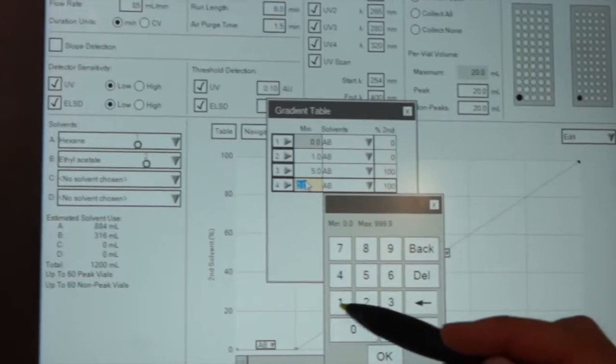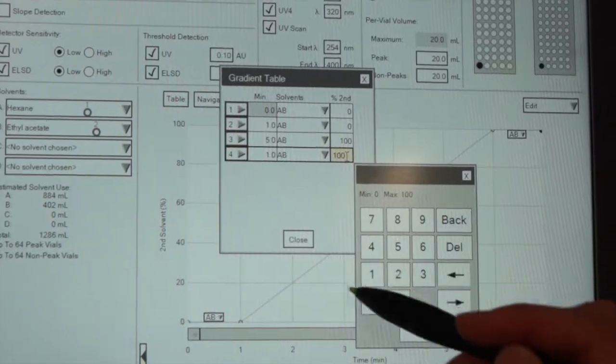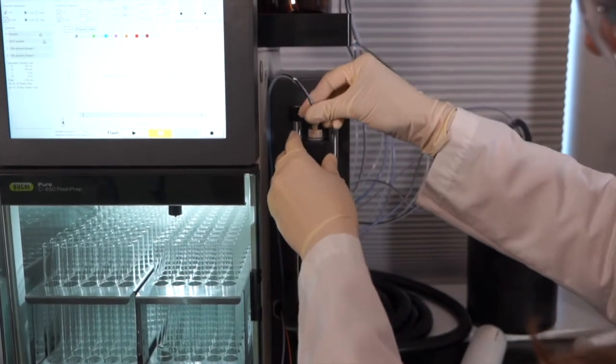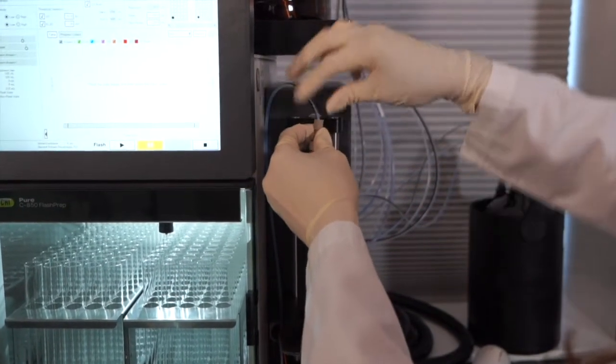As you can see, the Pure instrument is easy to operate and so is the software. All the important variables are visible on the main screen. There are two main ways to get gradients, either by inputting the steps in a gradient table or by dragging various points to change the flow of different solvents. For complex separation, you can even change solvent part-way through a run.